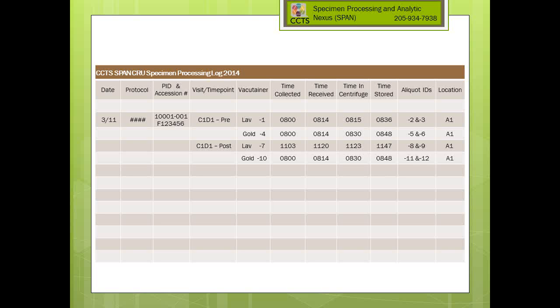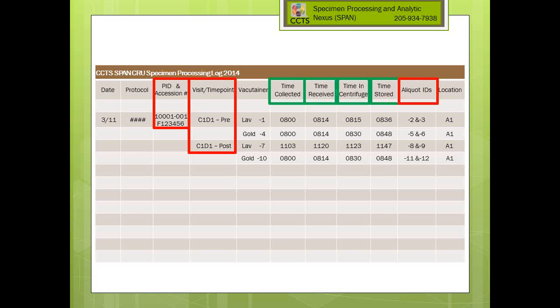In most research studies, you don't have this level of detail on your specimen, but sometimes this is important to know. And you need a way of tracking this that's consistent and allows you to link it back to your actual specimen.